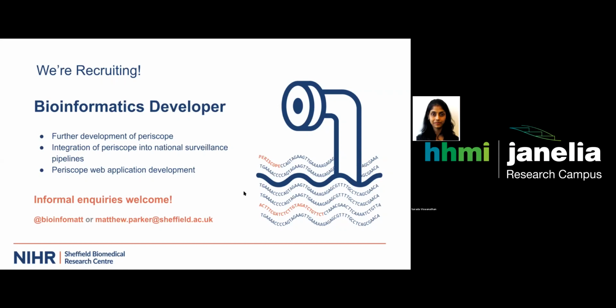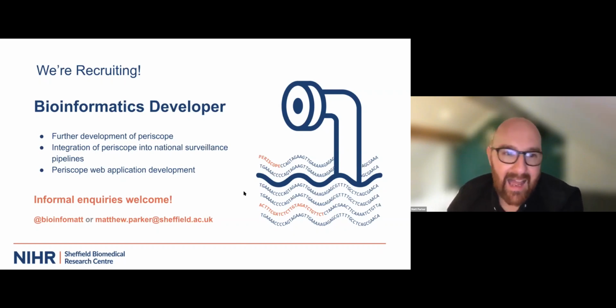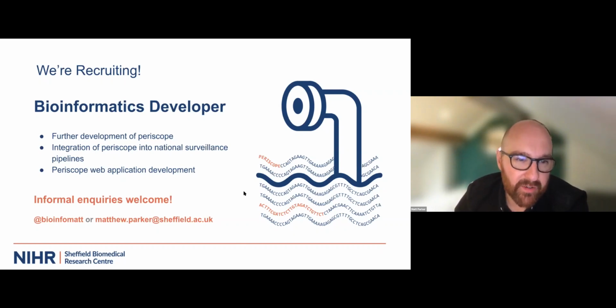I think, as I said at the start of the talk, our method is a byproduct of the genomic sequencing, right? So do I think it's a perfect method for subgenomic RNA measurement? I don't. I think our strength is numbers. With the B.1.1.7 work, we have so many data points that we can see this effect of B.1.1.7 in our subgenomic RNA data from the genomic sequencing. So we need numbers, and we need numbers of both that and the clinical data, which is difficult to come by.